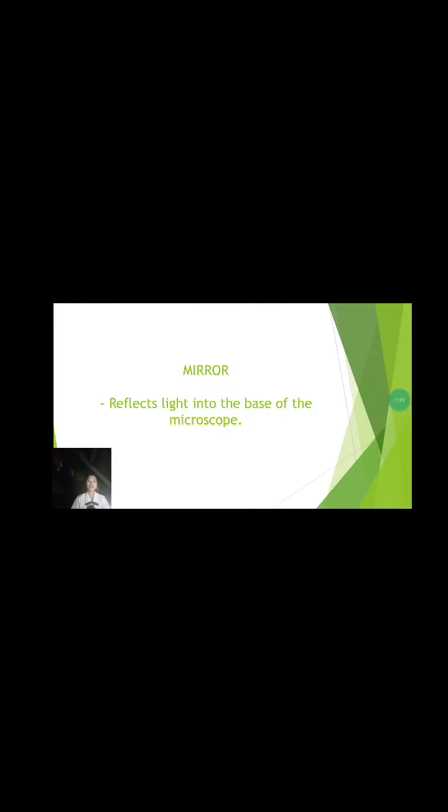Okay, earlier microscopes used mirrors that reflected light into the base of the microscope instead of halogen bulbs as their source of illumination. Gamay ni siya nga trivia ha. Mas gi-innovate pa maayo karon, so mao na siya ang na-come up.